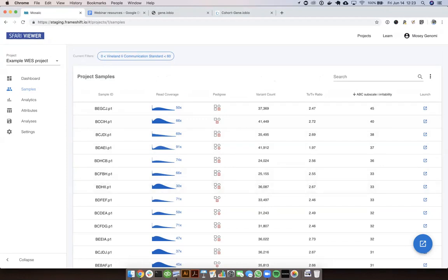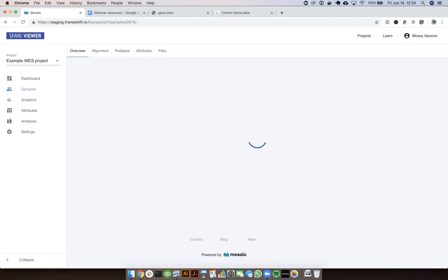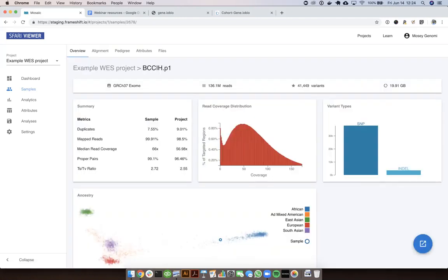And so there's a lot of power to really manipulate the data that we're looking at and find the cohorts that we're interested in. Now, there's a lot more information available within this app. I'm only going to show one more view so as to not overwhelm people with too much detail, but I can now jump down if I'm interested in this particular sample, for example. I can just jump down to a sample page and view more detailed information about this particular individual.